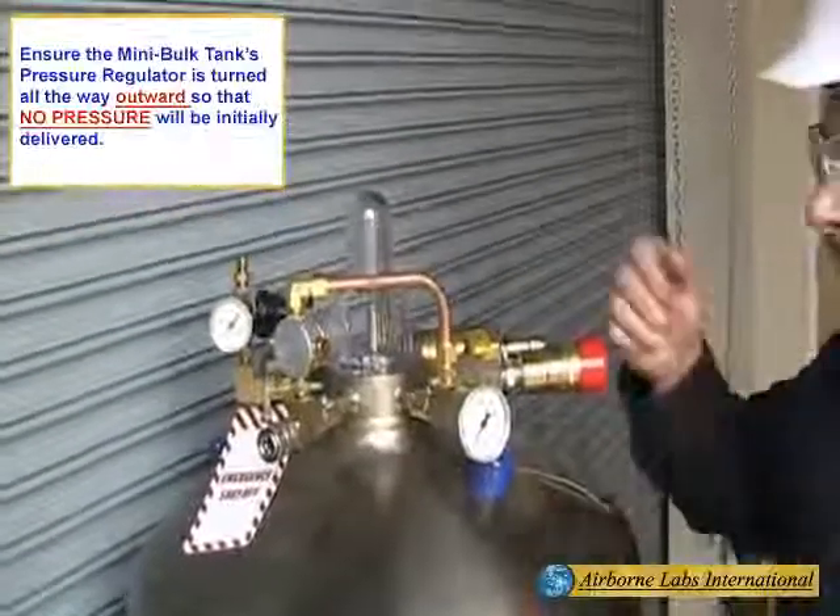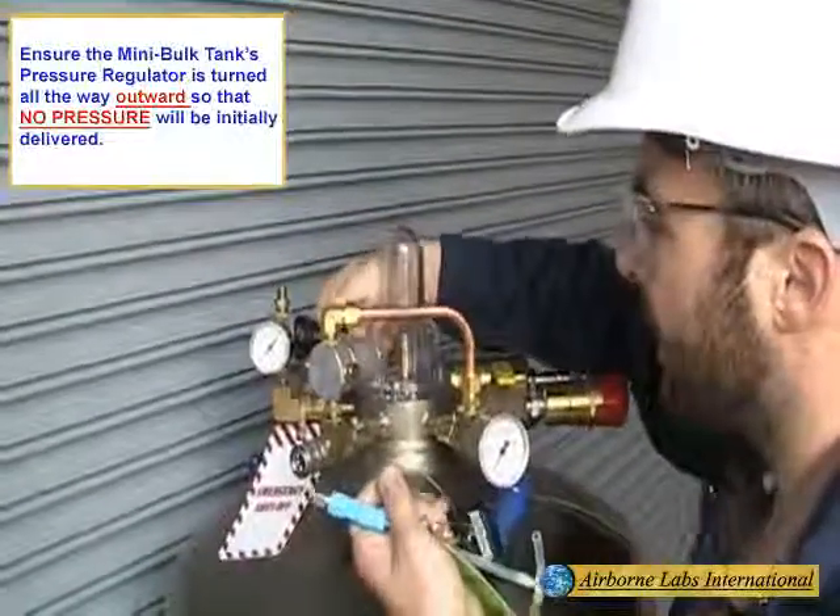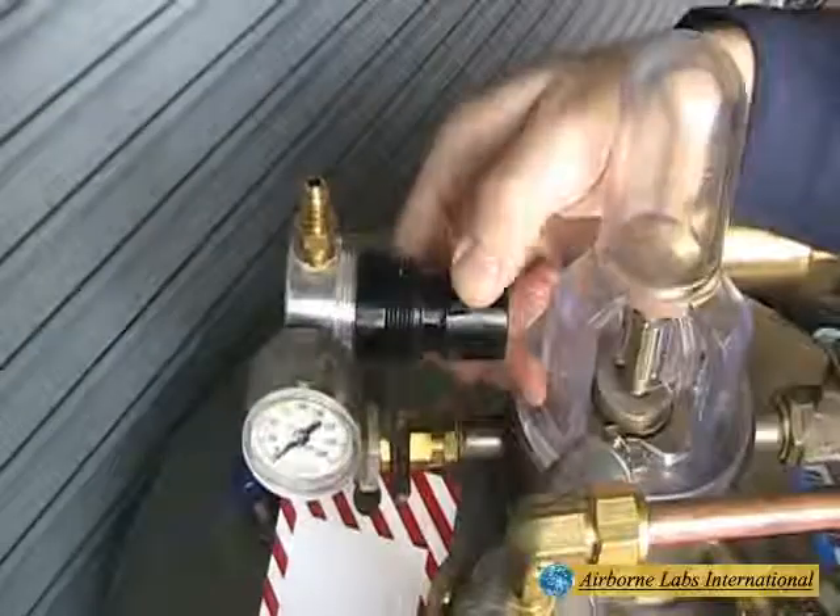Ensure the Mini Bulk Tank's pressure regulator is turned all the way outward so that no pressure will be initially delivered.